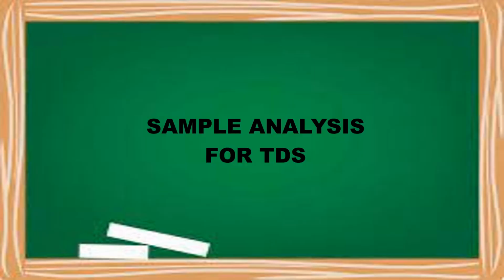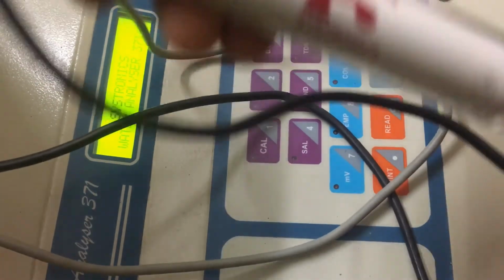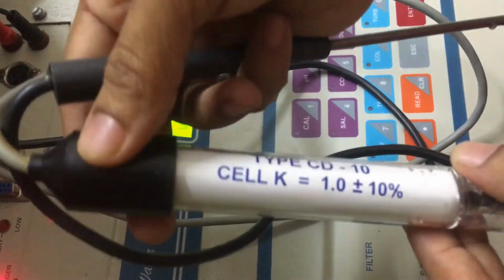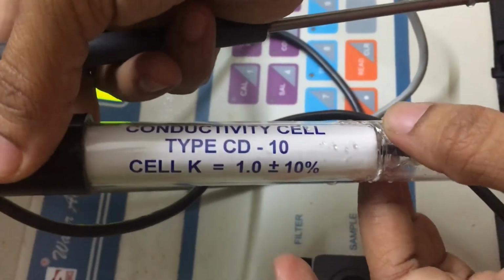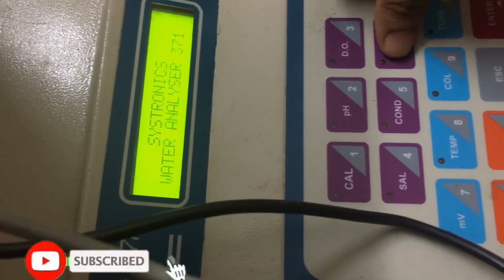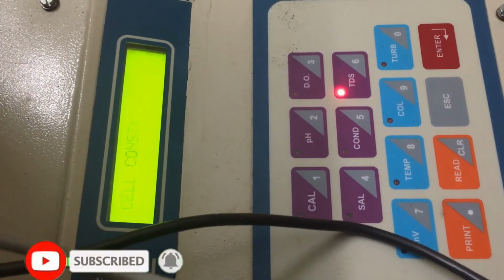Next, we are going to analyze the sample for TDS. As we already calibrated the instrument for conductivity, there is no need to calibrate it again for TDS. For testing TDS also, we have to use the same probe that we use for conductivity, this one, and connect the temperature probe also along with that. Then we need to select the function TDS, and it will display cell constant.